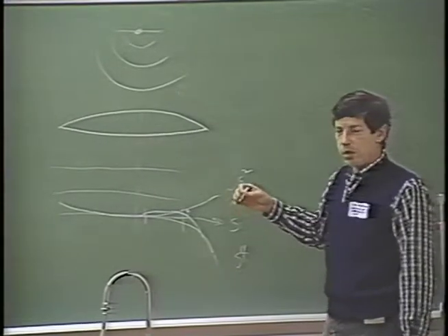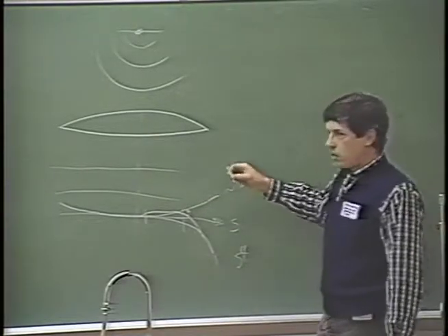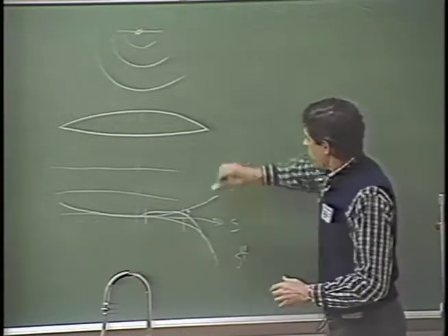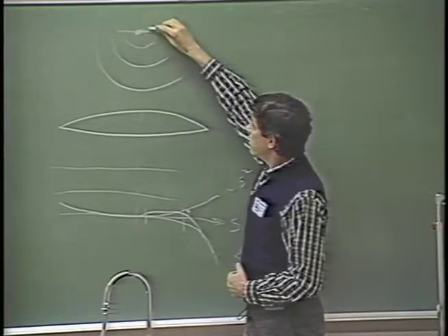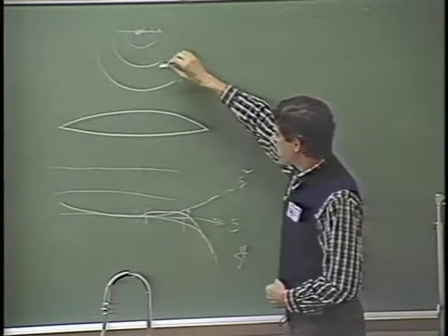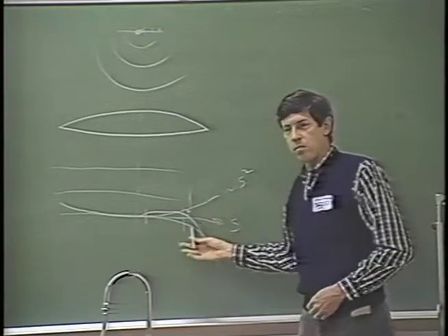Now, where the voltage comes in has to do with the range of scattering in the back focal plane. At 100 kV, electrons are scattered into wider angles because the wavelength is longer. So if you have spacings in the specimen, suppose at about 3.5 angstroms, you'll have electrons that are scattered out to, say, this range around here in the diffraction pattern.